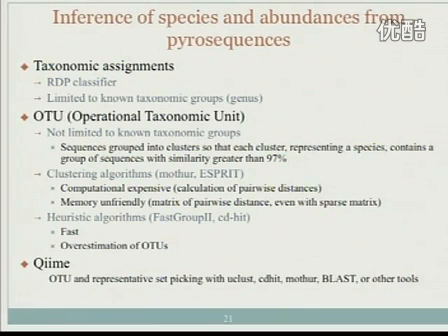Because there are so many reads, you cannot just do Smith-Waterman alignment. That's the reason the Greengenes team came up with this RDP classifier, which is really a naive Bayes-based method that just looks at the frequency of k-mers. So you don't do real alignment. You just look at the k-mer frequency so that you can hopefully assign one read into one of the clades. Actually, they can only go up to the genus level. So I can assign that this 16S gene fragment is probably from that genus.